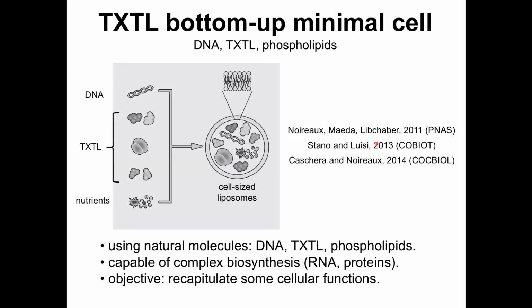I took this image from an article from Pasquale Stano and Pier Luigi Luisi. There are other articles that I have written also on this. You try to encapsulate your cell-free reaction with your DNA and the nutrients, and to express genes in cell-size liposomes using the natural molecules and building blocks, and try to start recapitulating biological function.